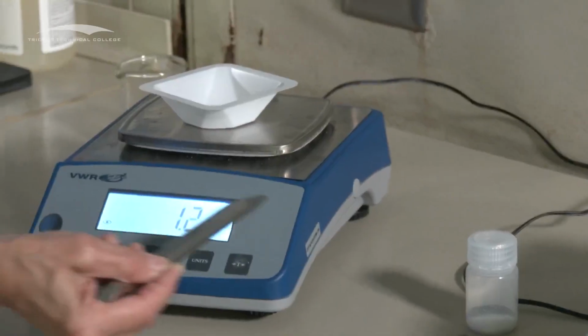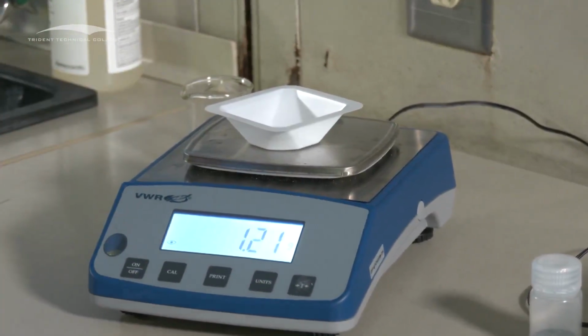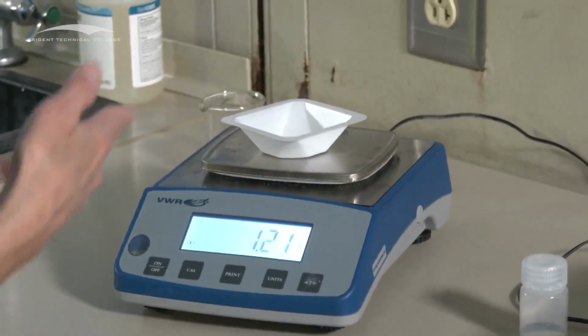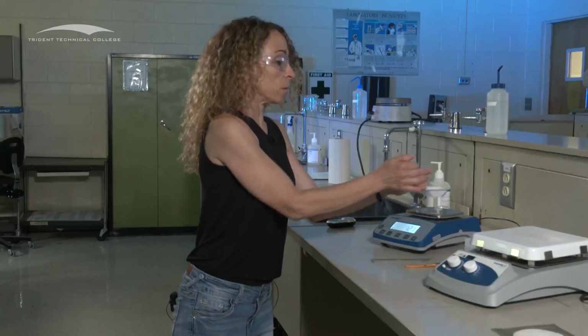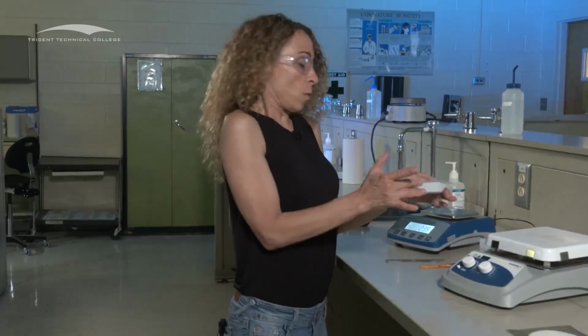Done. Now you're going to record the weight as you see it. Now try to get close to 1.00 gram. Take your time as you can. Now, this is your solid, okay? This is the weighing of the solid.